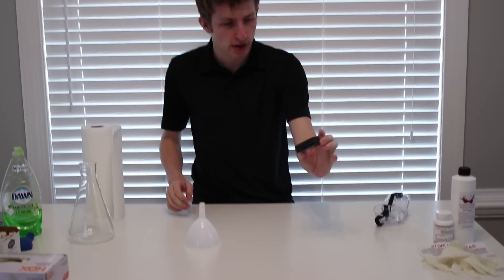We got a battery for the camera. Sam, how are you recording without a battery? That's something, guys. And so, basically we're going to be doing something called creating elephant toothpaste.